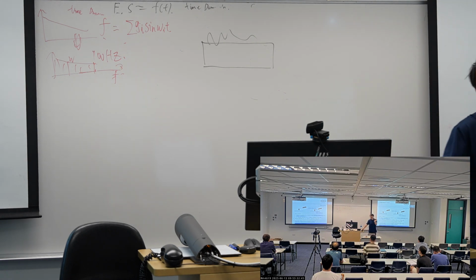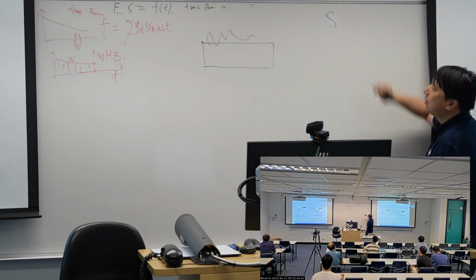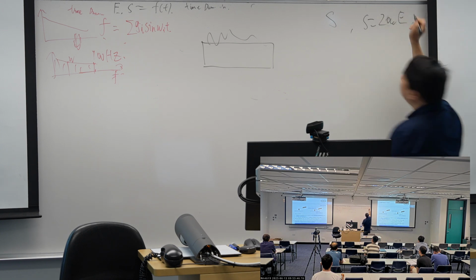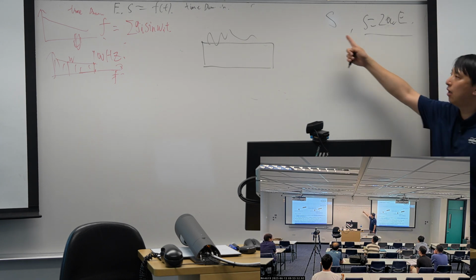We get the stiffness out and use a contact model to calculate modulus. So we get stiffness and then the Hertz model. We leave the Hertz model to the next step, and we get the stiffness out first.